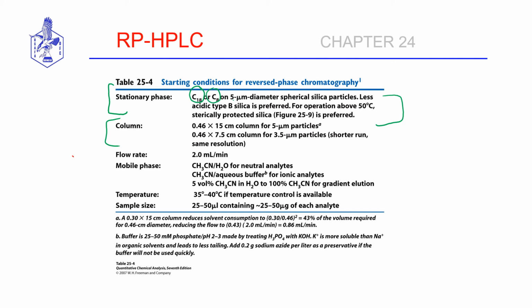We must select, for the mobile phase, the flow rate. Remember the optimization of the flow rate to minimize plate height and band broadening. Then we must select the mobile phase components. Is it isocratic? That is, are we going to use one solvent throughout? Or are we going to mix several solvents to tweak the polarity of the mobile phase? Then we have the choice of varying the temperature of the separation. Sometimes that's needed and useful.